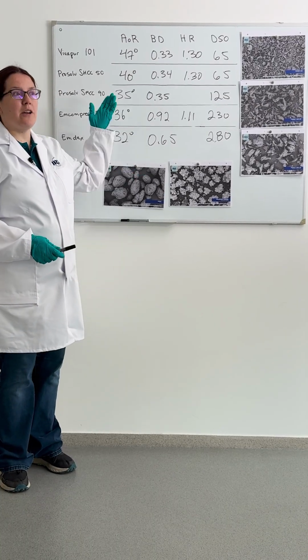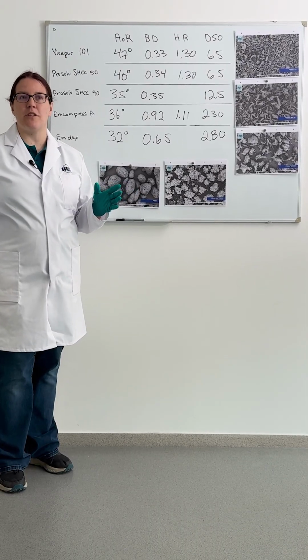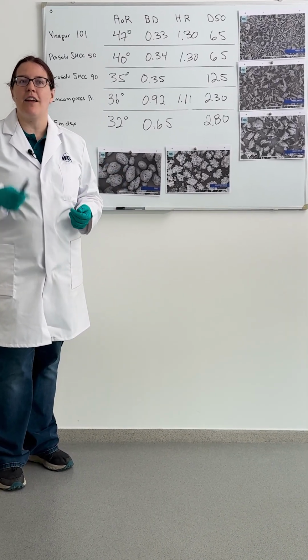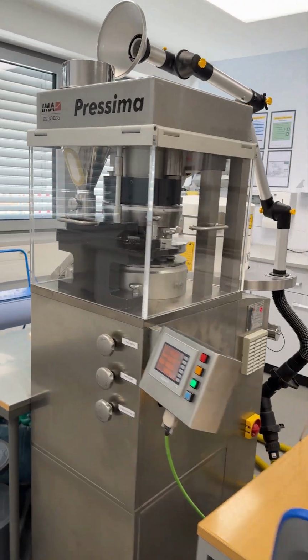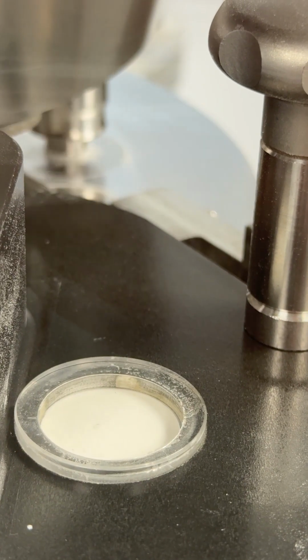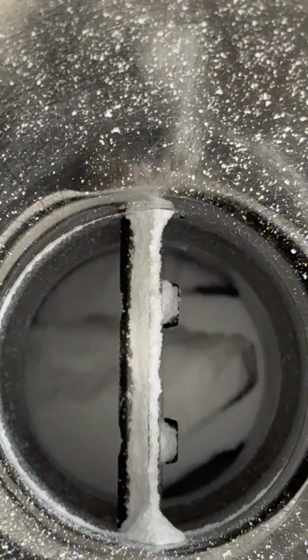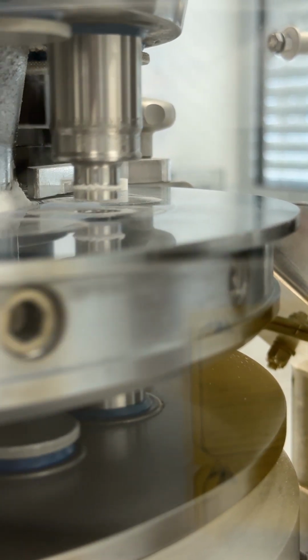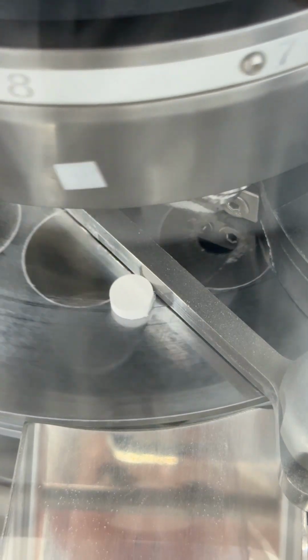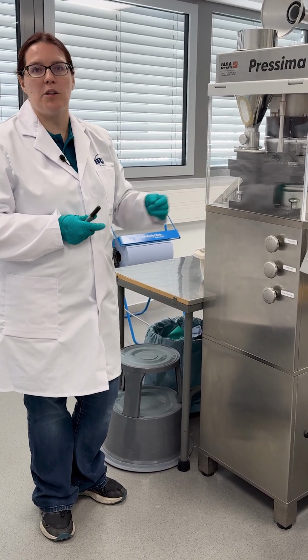So Hausner ratio, angle of repose, at the end of the day, none of these laboratory methods really give a full picture of flowability as it relates to tableting. The true measure of flowability is, of course, the tablet press. Here you'll be able to see differences such as how the powder interacts with the material of the hopper, and also be able to adjust for flow challenges by using a paddle feeder to push material into the die. As a result, the Flodex does not limit what die size you can use, and the angle of repose can be overcome by a little bit of force.